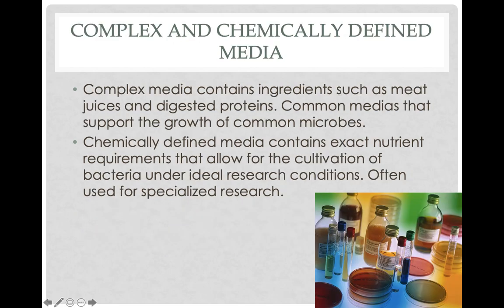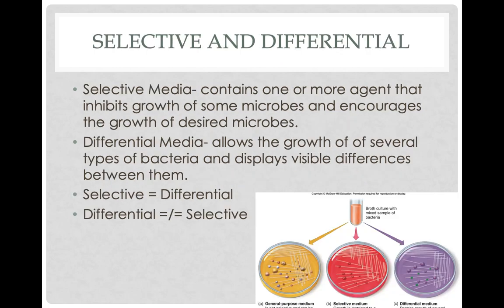So same thing here, chemically defined versus complex. So selective and differential. So this is kind of a step back a little bit. So any type of agar can be selective and differential that's not general purpose for the most part. There are a couple of general purpose that are differential, but not always. So what this concept is, general purpose medias will allow pretty much every single bacteria species to grow.